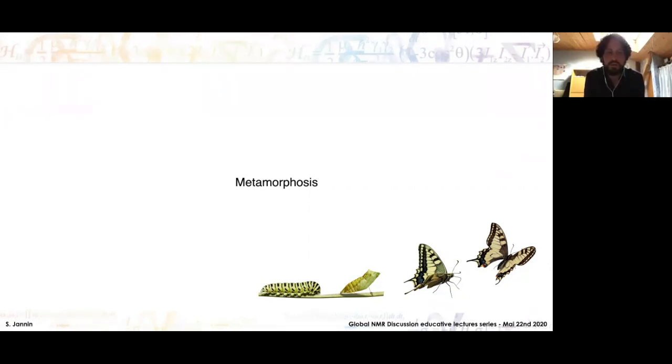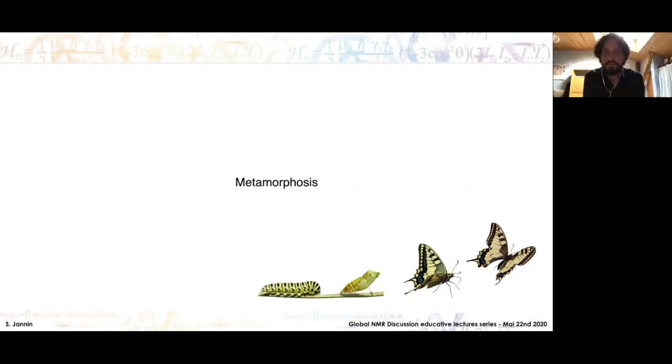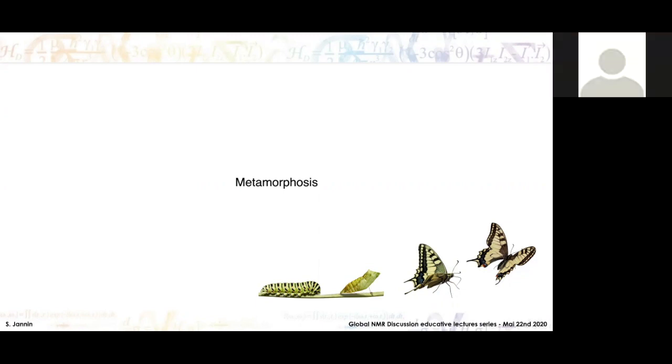I may just add a comment, Sami. Few people, if any, have polarized proteins directly by DNP in the polarizer, because you will then rapidly heat them and probably destroy them. So what has been done up to now is to polarize water and transfer to the protein, or polarize ligands. Polarizing the protein directly would be very difficult, first because you will destroy it, and then if it is paramagnetic, you will have extreme relaxation during the transfer.